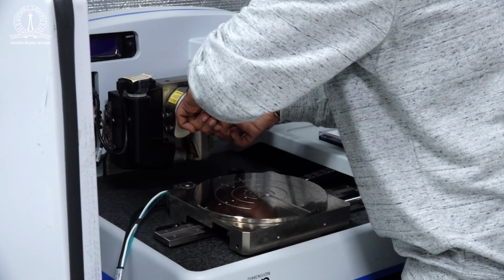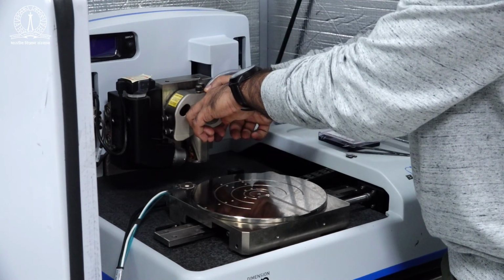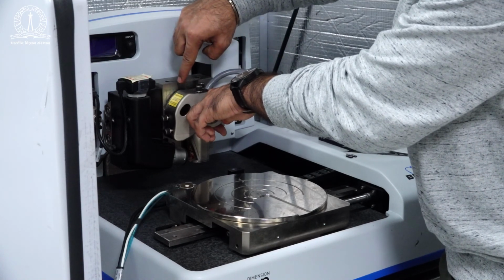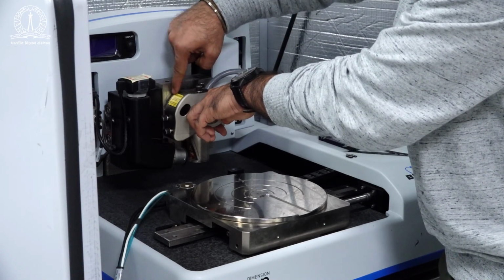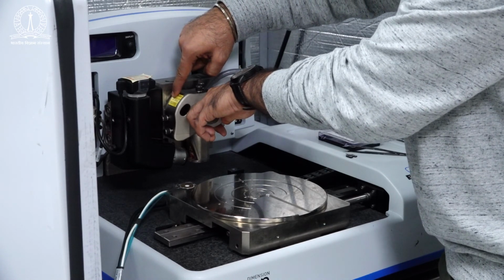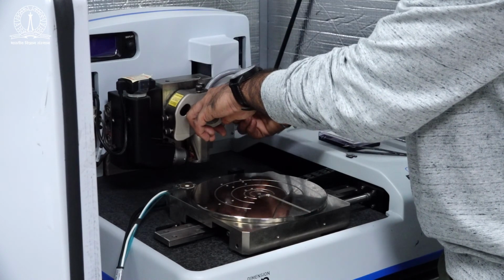All the way down, and when you put it down all the way in a controlled fashion, finally you need to look at this part where there is a sketch pen mark. As you can see, this should be seen to us completely properly. Then tighten this screw.